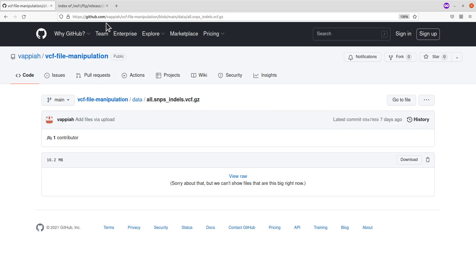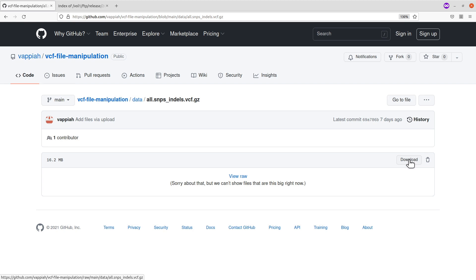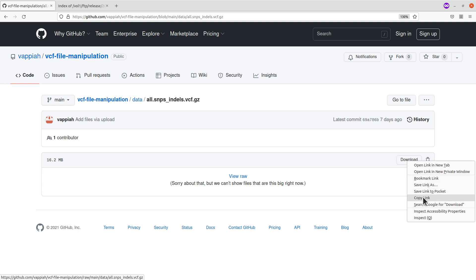The other approach is used if you are working on a remote server where you have access to only the terminal or command line. For that, you need to have the download link. To get the download link, still bring your cursor over to the button and then right-click it.